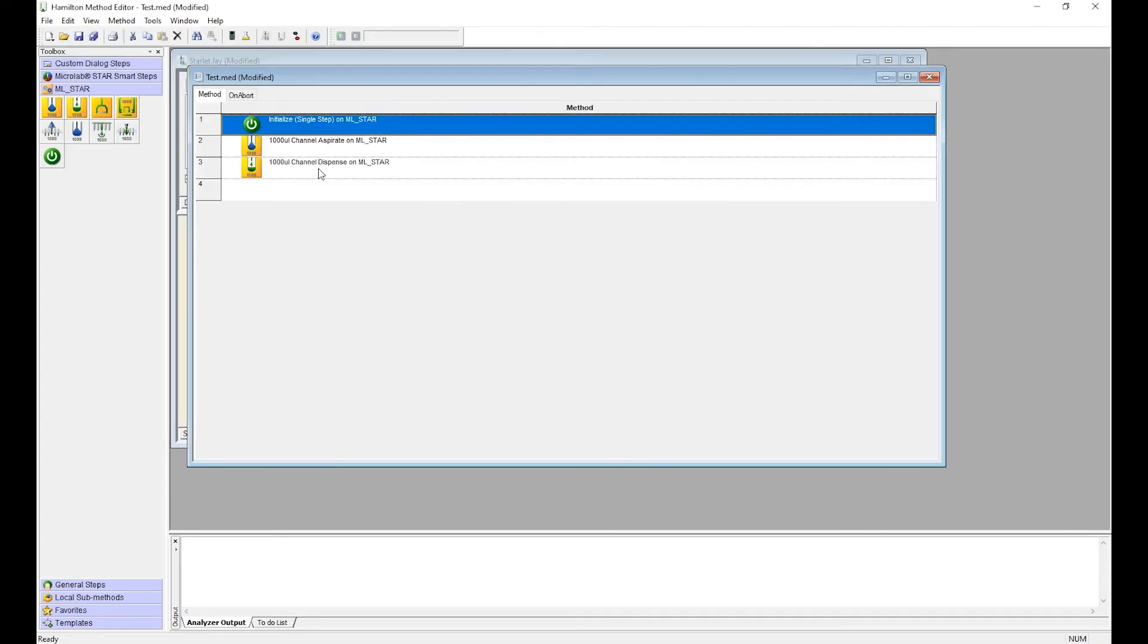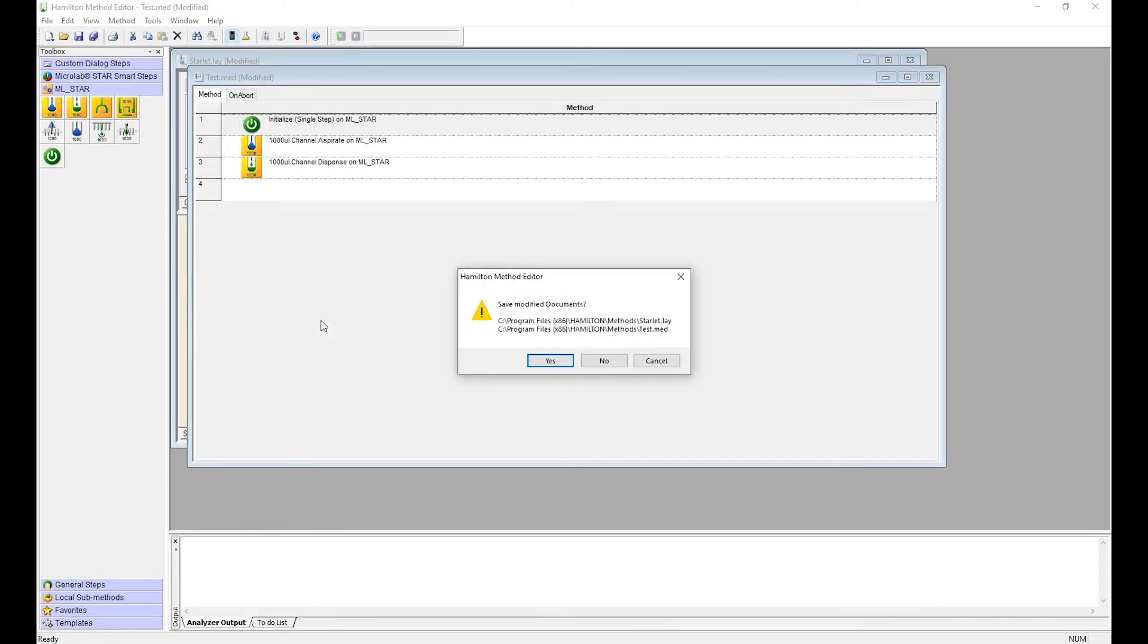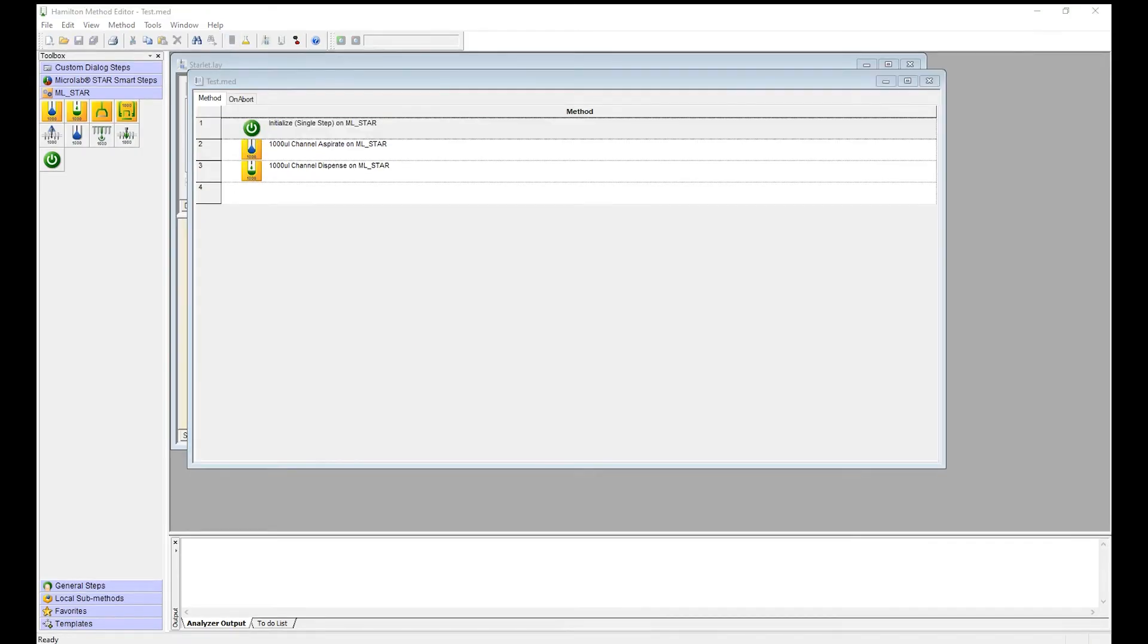Once the method is created, go up here to the stoplight, the run control stoplight. Select that. It'll ask if you want to save. Say yes. And now you have the run control window and this is where you start the method. Once everything is green, go ahead and select start and your method will run.